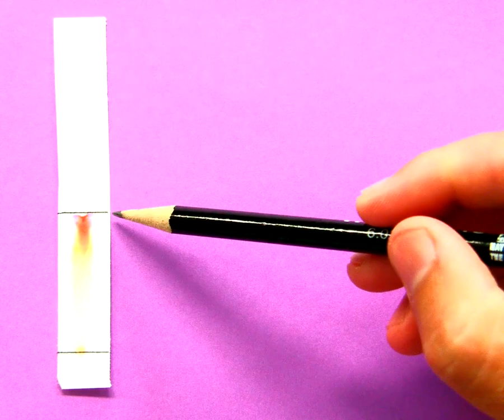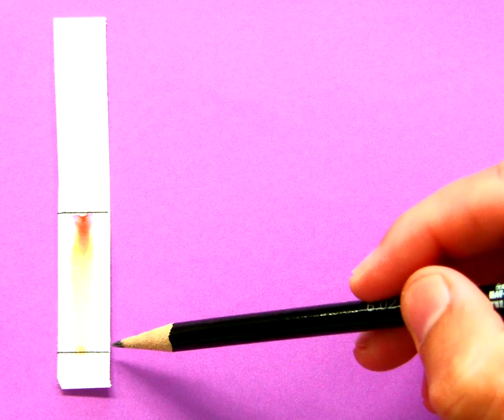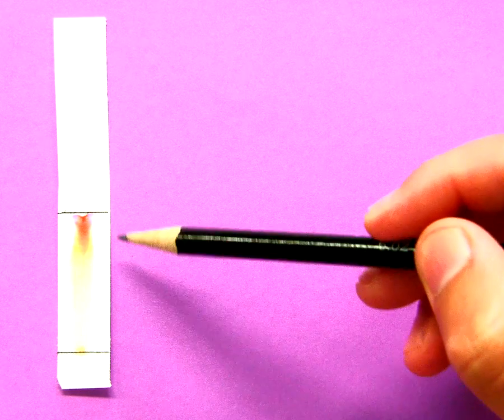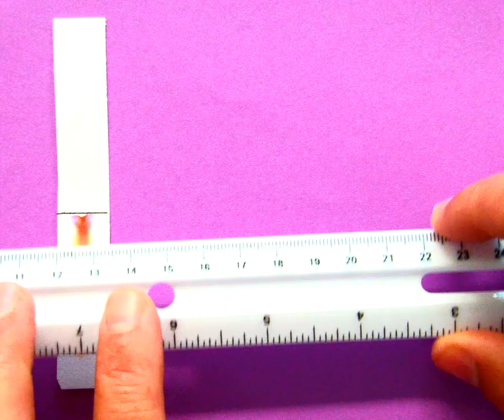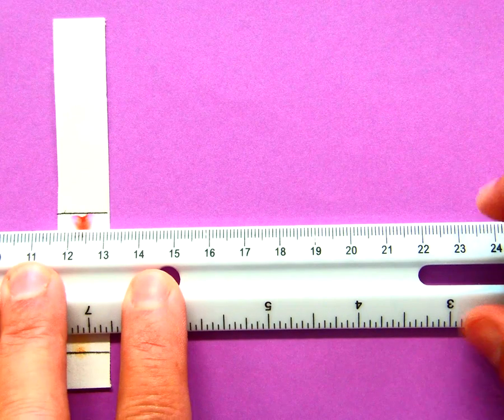Today we're going to be talking about how to analyze your chromatogram from your chromatography lab of the marker that you tested. So the first thing you need to do is to draw what you did in class, this line at the end, which you compare with the line from the beginning, and this is how far the solvent traveled. The other thing you're going to need to do is look at all the different colors that you see and put a line to the farthest place where that color traveled.